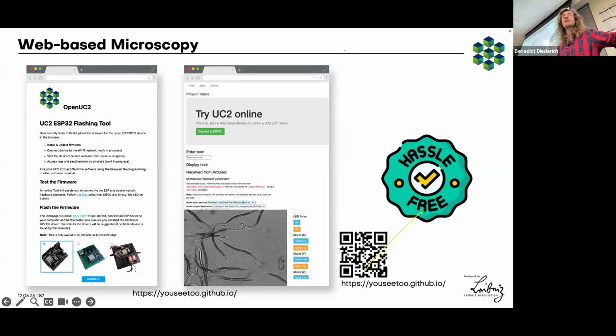But you can also control your USB hardware. So you can connect to your browser without installing anything. You can, for example, manipulate and observe this microscope, which I personally like a lot, because if you're in a class, you don't want to install apps all the time, because people sometimes don't want that, and then it just works out of the box.